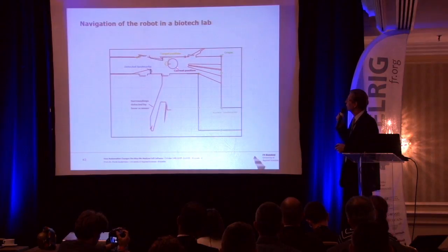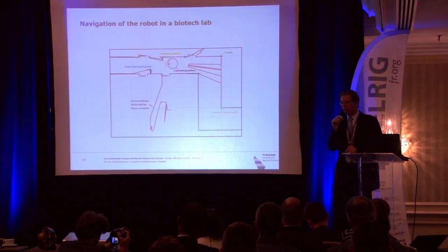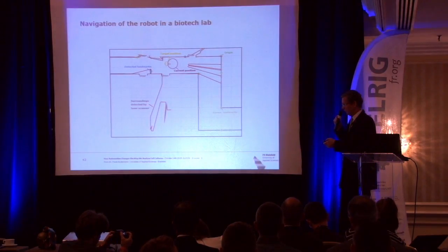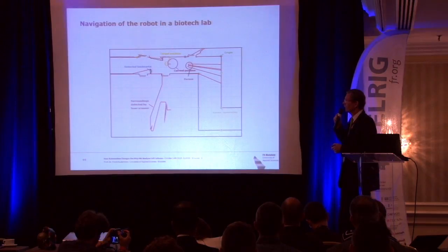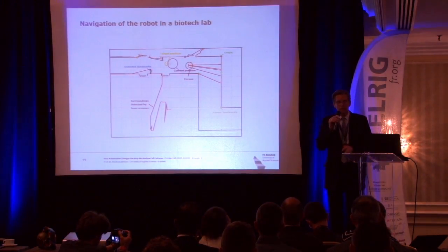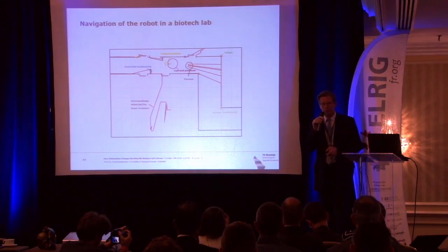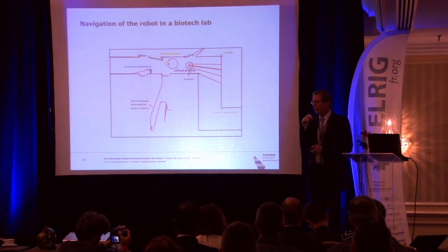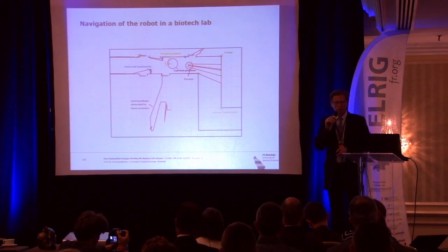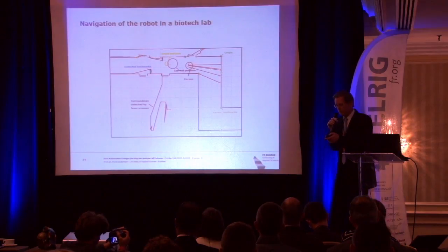There are position marks that are recognized, so the robot knows by recognizing those marks where it is, and there is a person standing behind the robot, because these are the two legs. The laser scanner scans at a height of 20 up to 30 centimeters, and this is how the robot views us as people, only the two legs. But that's enough to move then in a different direction.